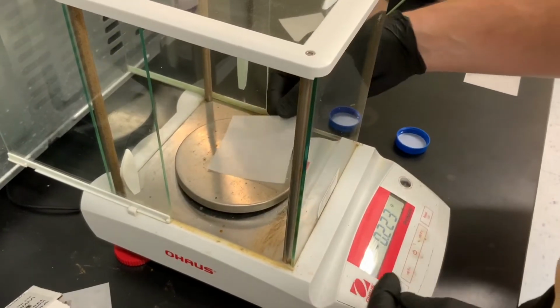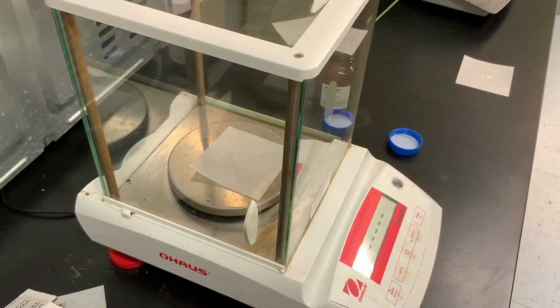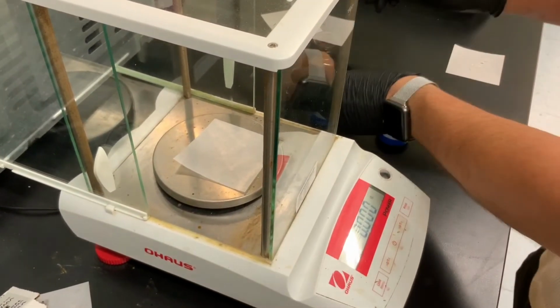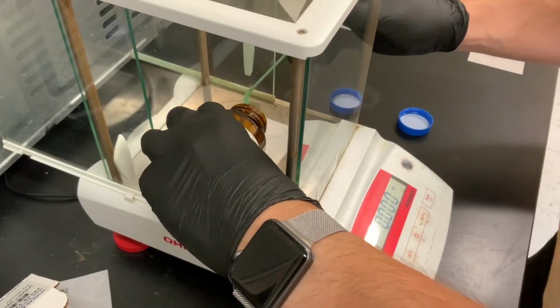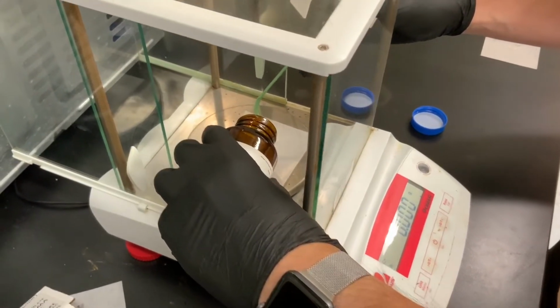And now I'm going to tare another piece of weighing paper. And I'm just going to, again, scrape the sides here because I really don't need that much of the stuff in the actual bottle.